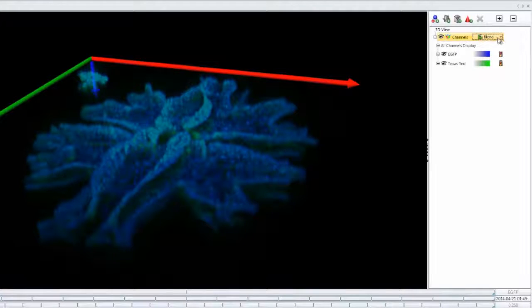We can choose the different ways of blending these channels, as we've mentioned in previous videos: max, min, and blend. We'll choose blend for this video. The first thing we want to do is make a slice. We have options of ortho slice, also known as orthogonal slices, that create perpendicular or parallel angles to the volume, and we can add an oblique slice. The oblique slice creates neither perpendicular nor parallel angles to the volume.